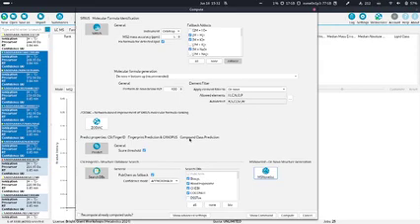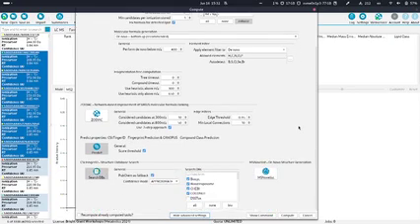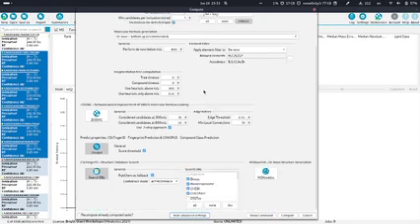And this was also all the methods we can toggle here. What I said already, there is the advanced mode. And if you click on this at the bottom, you will see that now we have some more settings. I will not go into the detail here, but for example, if you see that your computations are taking a really long time, something that takes a long time to compute is the fragmentation tree computation. And maybe you might want to introduce a timeout here. But in most cases, especially now because the bottom-up search is fast, you should be good and should not be required to turn anything else on here.